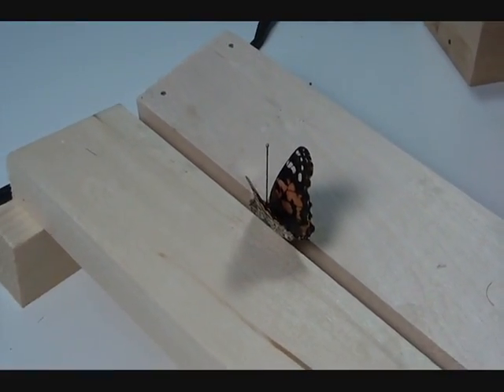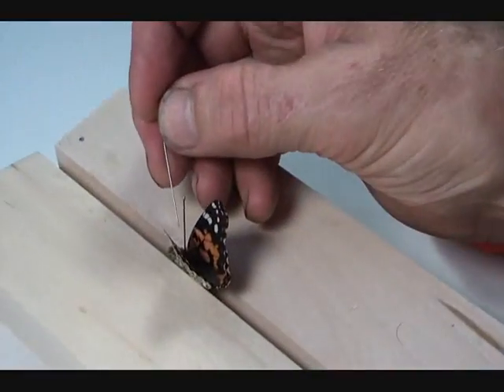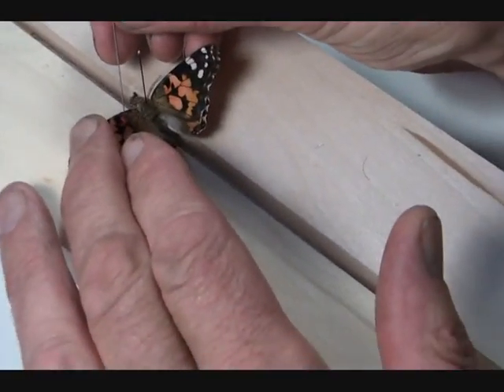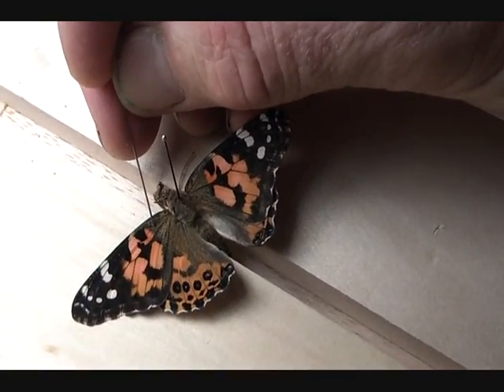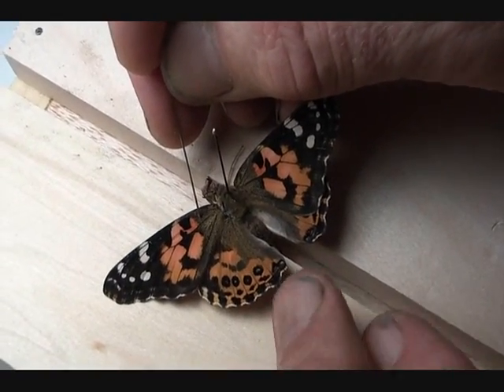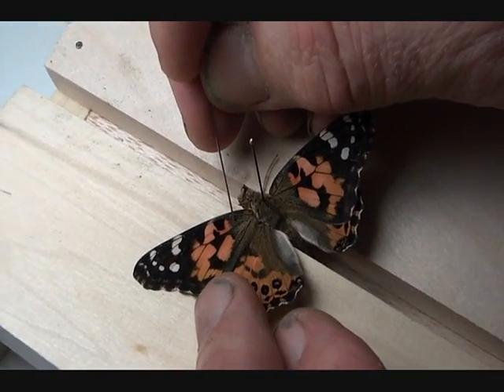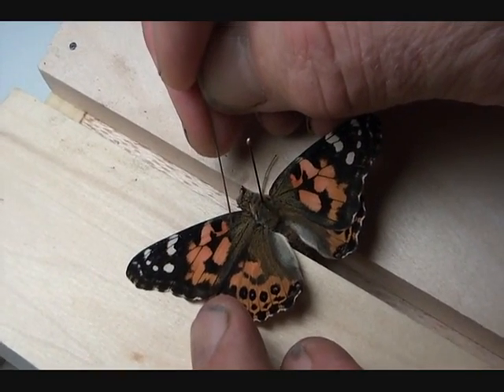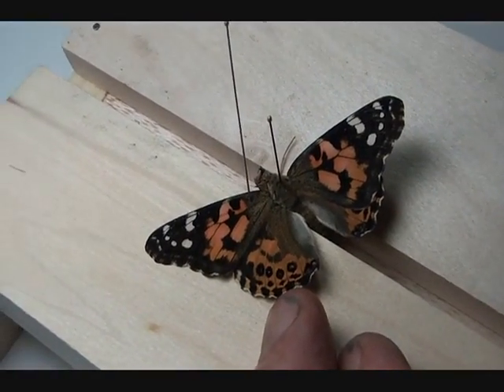Take a very fine pin and go right behind the subcostal vein — stick a pin right in there. Move it up in the arc of the wing; don't pull it straight up, but follow the arc of the wing. Pull it up until the trailing edge of the forewing is perpendicular to the body — or more precisely, perpendicular to the axis of the spreading board. Notice that the pin is slanted so it stays in place.